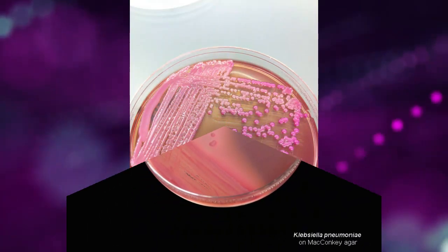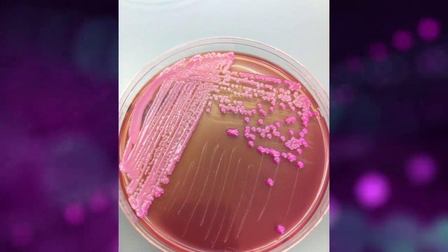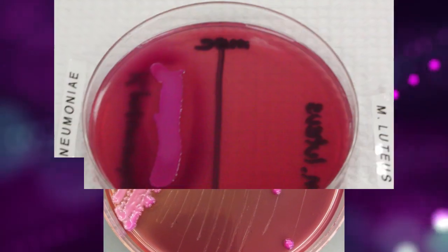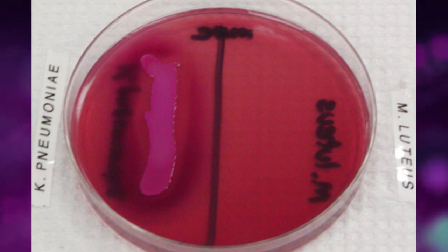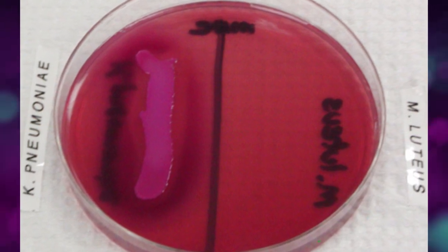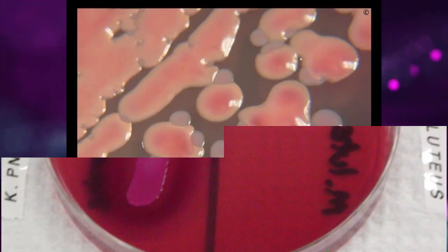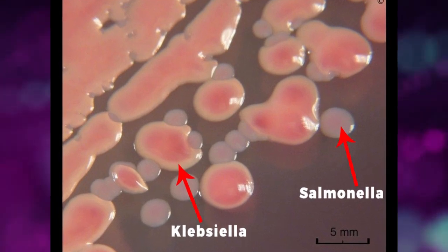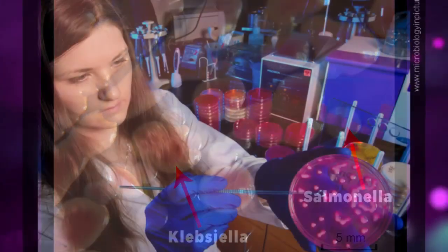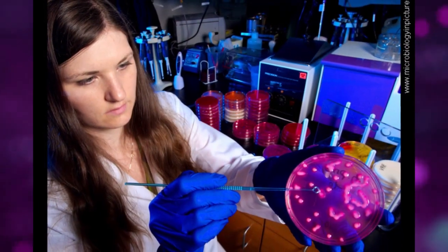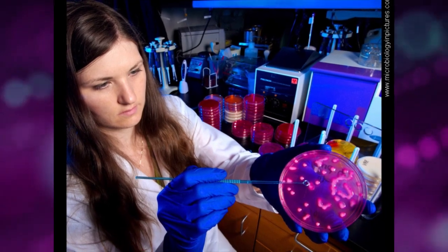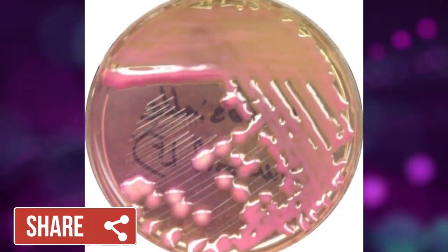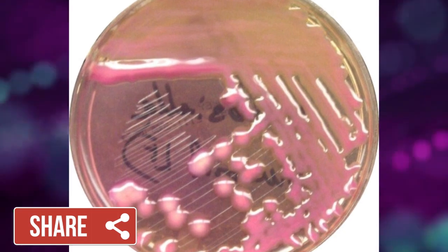Klebsiella pneumoniae colonies give pink color on MacConkey Agar media, due to fermentation of lactose, which is of great importance for differentiation of Klebsiella pneumoniae from other gram-negative bacteria and Salmonella species, which are non-lactose fermenters and give colorless colonies on MacConkey Agar. Though this pink color may not be clearly apparent in very mucoid colonies.